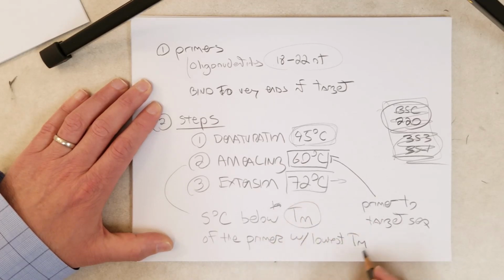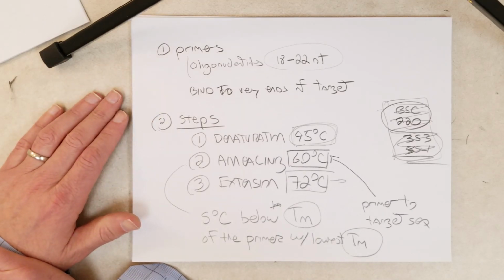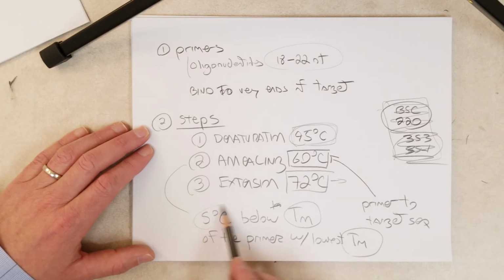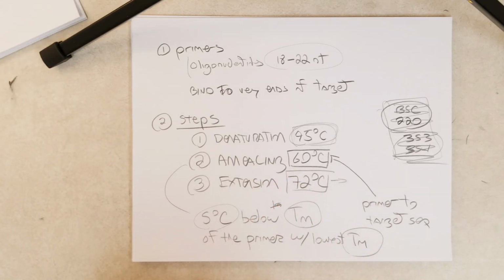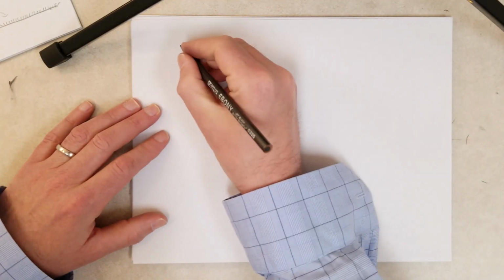Okay, what is TM? Do you remember? So TM is melting temperature. This comes back again and again. The melting temperature of a DNA molecule comes back again and again throughout genetics courses, and especially in this course. So we want to choose an annealing temperature that is 5 degrees below the predicted melting temperature of the primer with the lowest TM. Okay, so why? What does that matter? So now we know what melting temperature is, maybe you remember.